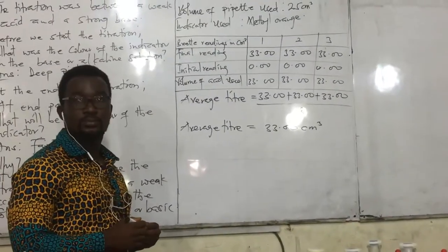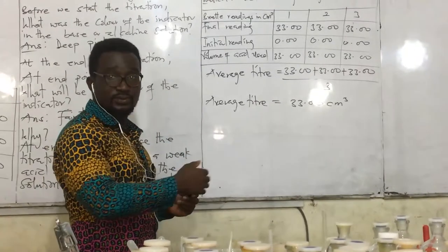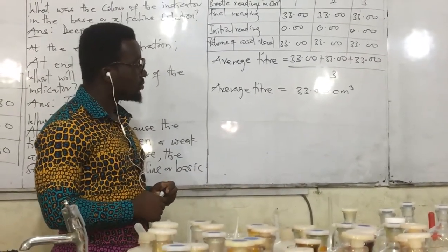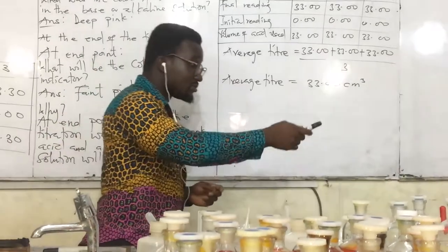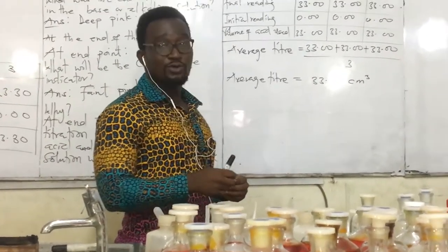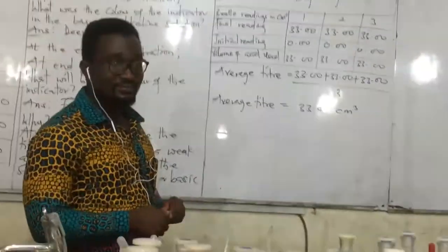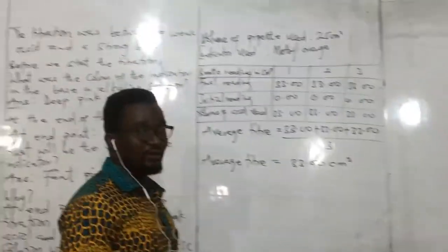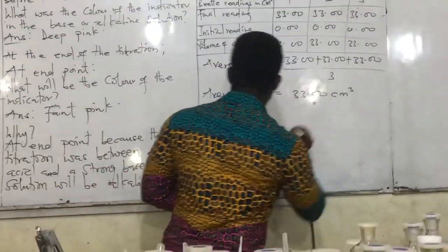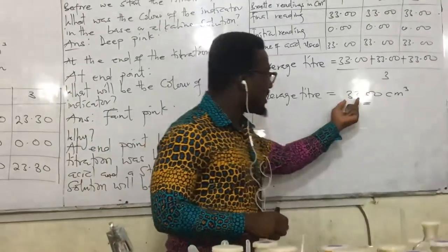So we have single... The madam wants to confirm with the calculator whether it is correct. Confirmation is necessary. So that is our average titre.